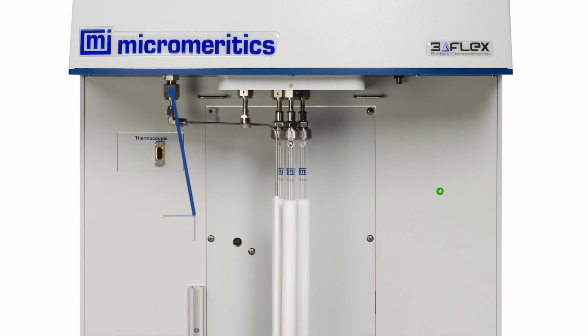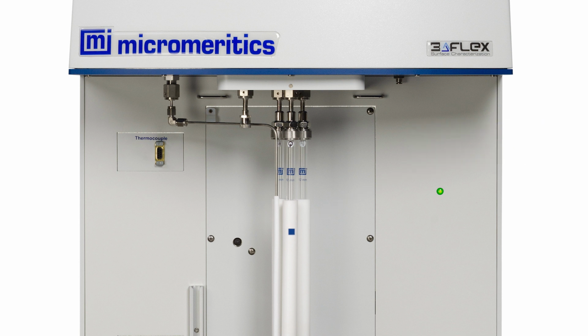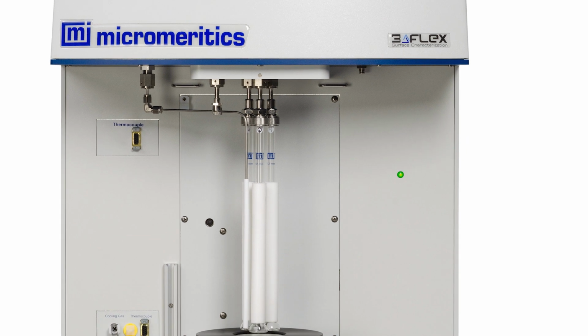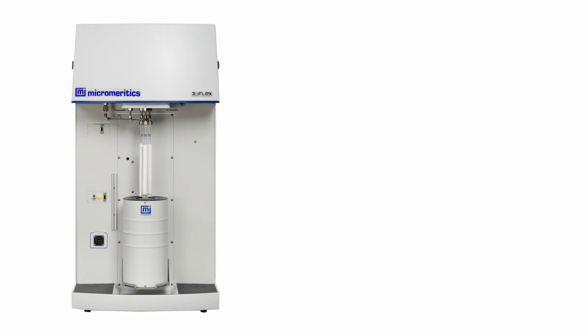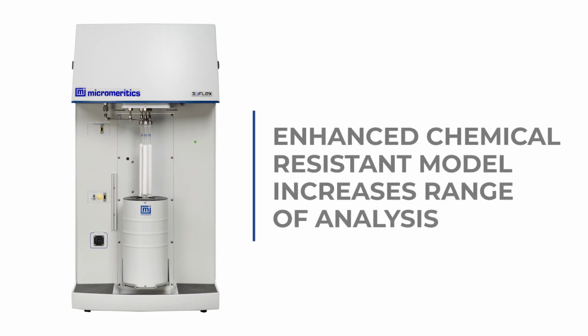The p0 port provides continuous monitoring of saturation pressure during an experiment, and isothermal jackets ensure that your samples always remain submerged in liquid nitrogen. Analysis ports can be configured for krypton analysis, which is essential for the analysis of low surface area materials. The 3Flex can analyze the widest range of gases and vapors due to its chemical resistivity. An enhanced chemical resistant model is also available to further increase that range.